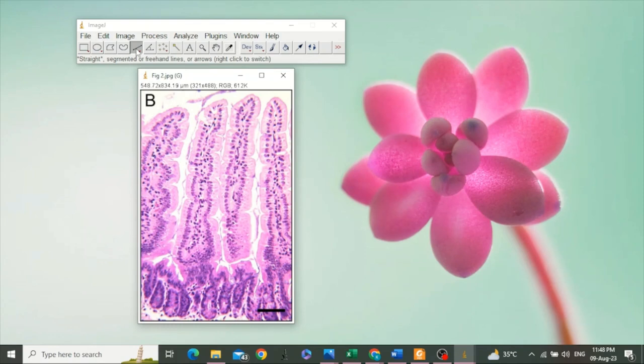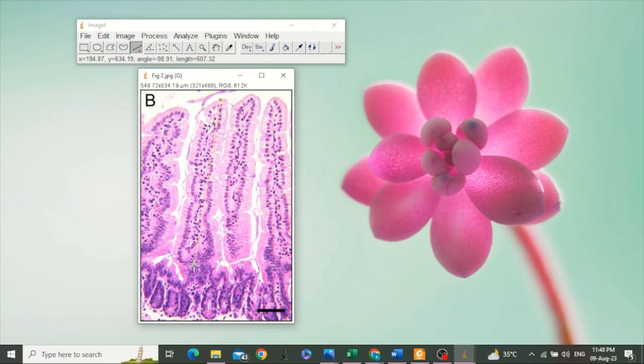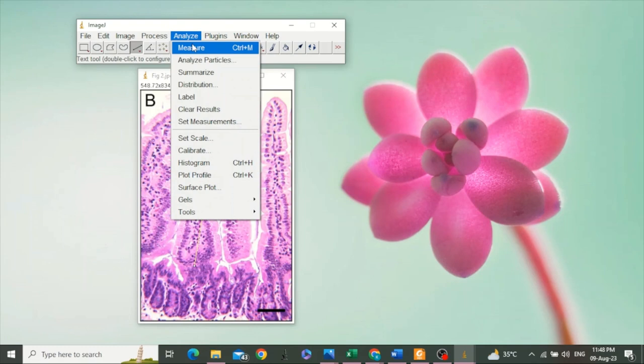We can measure the villus height. Draw a straight line from its apex to its base, then go to Analyze and click Measure. You can also use a shortcut, which is Control plus M.